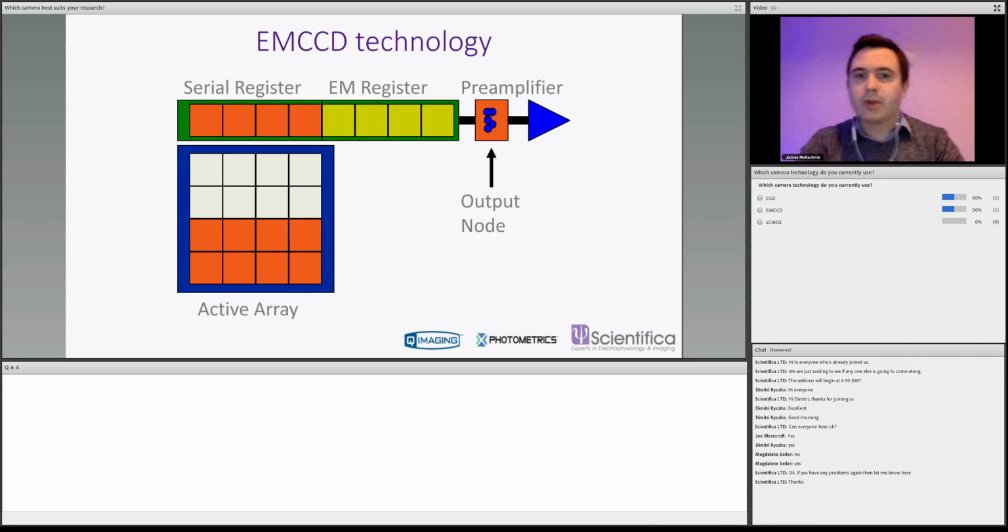Because we're clocking that faster, we're getting a higher read noise. So a lot of our EMCCD cameras will be somewhere around 50, 60 electrons of read noise. But we're boosting our signal before we reach that, and so we're effectively boosting the signal up above the read noise and making it able to see. Now, this isn't a lossless situation. If you look here, we go from 1 to 2 to 3 to 5. What we're visualizing there as well is that there's an uncertainty associated with what your multiplication will be through that register, and whenever we have an uncertainty, that's another noise characteristic.